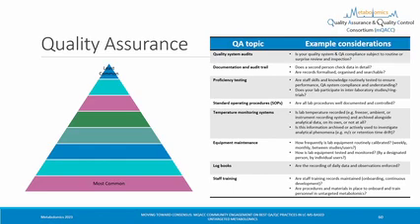Okay, so down here, these are more common in our field because these principles, like training your staff and having logbooks, are more core principles of just business and employment and then of basic science, right? So these are very common regardless of whether you're in a big company, a service organization, a center, a CRO, a core facility, or an individual PI academic lab. Whereas some of these at the top are often just less common because they're associated with larger organizations.